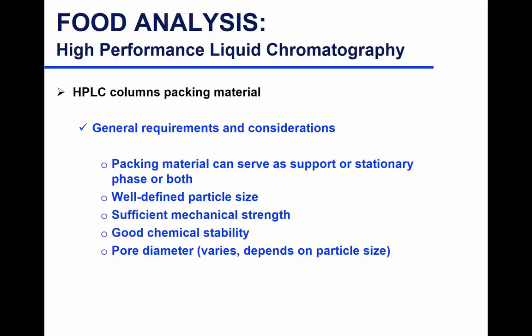Also pore size is important, pore diameter. You don't want your solutes to go into the pores and get delayed on the stationary phase. You want it to be stable over a wide range of pH and salt and temperature. You don't want it to break down on you. And then it must withstand mechanical stress, because after all, it's high pressure. So you want it to withstand high pressure compared to low pressure chromatography.